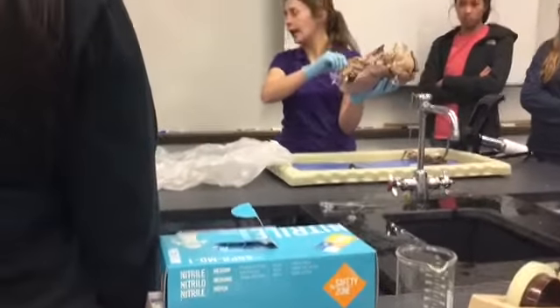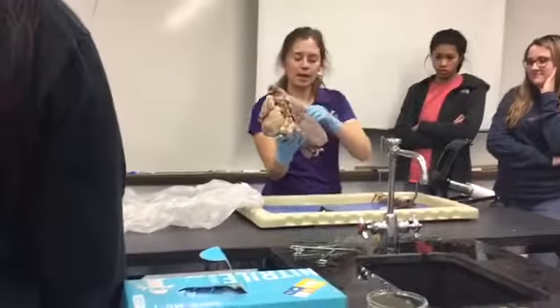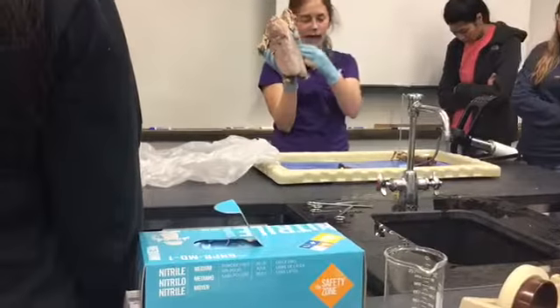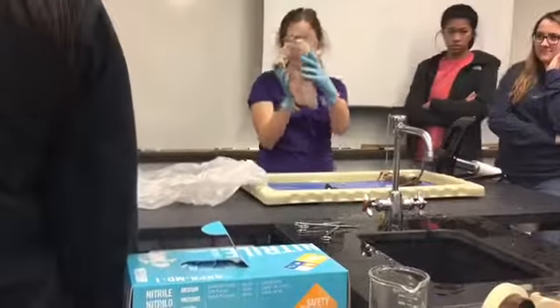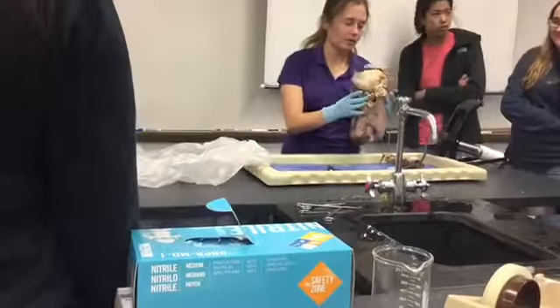This is part of the diaphragm. Some of your plucks will still have diaphragm, others won't. Back here, there was some connective tissue that I cut out. This is part of the mediastinum. There's more of that kind of up in here, so you can cut that out if it's in your way.